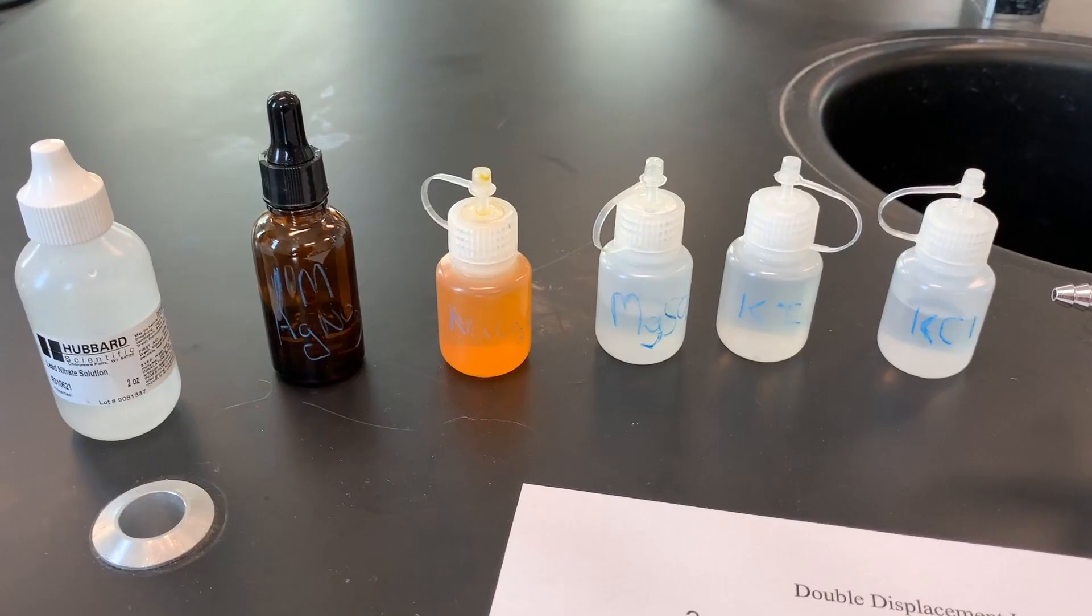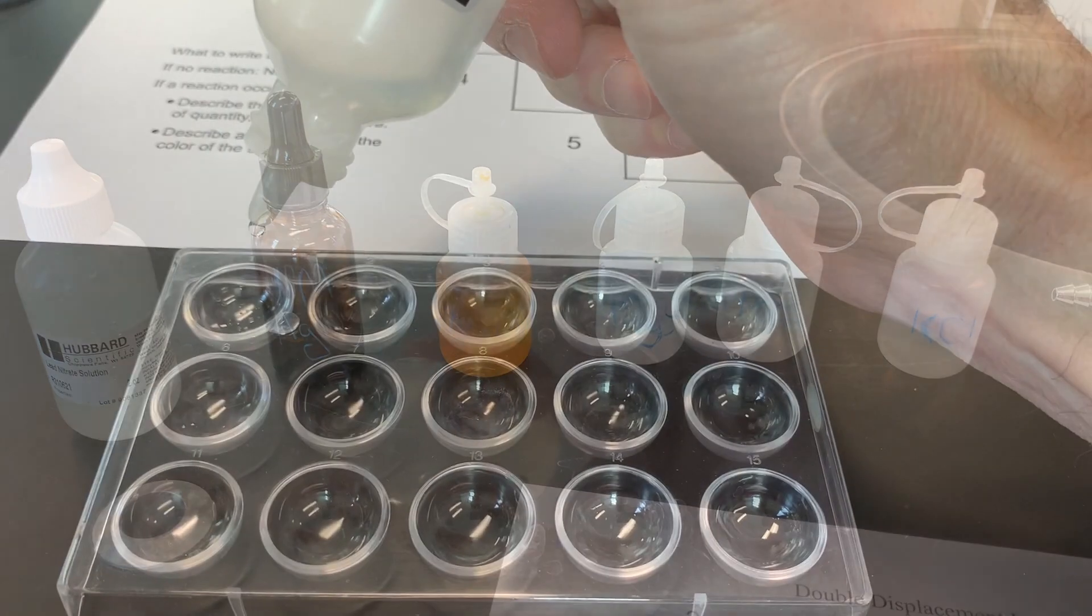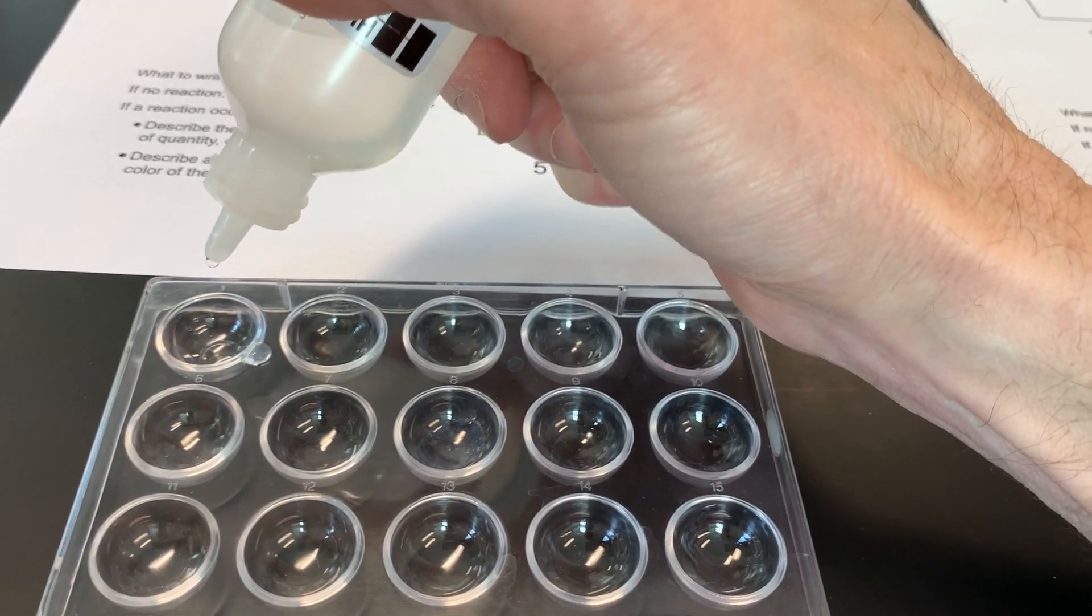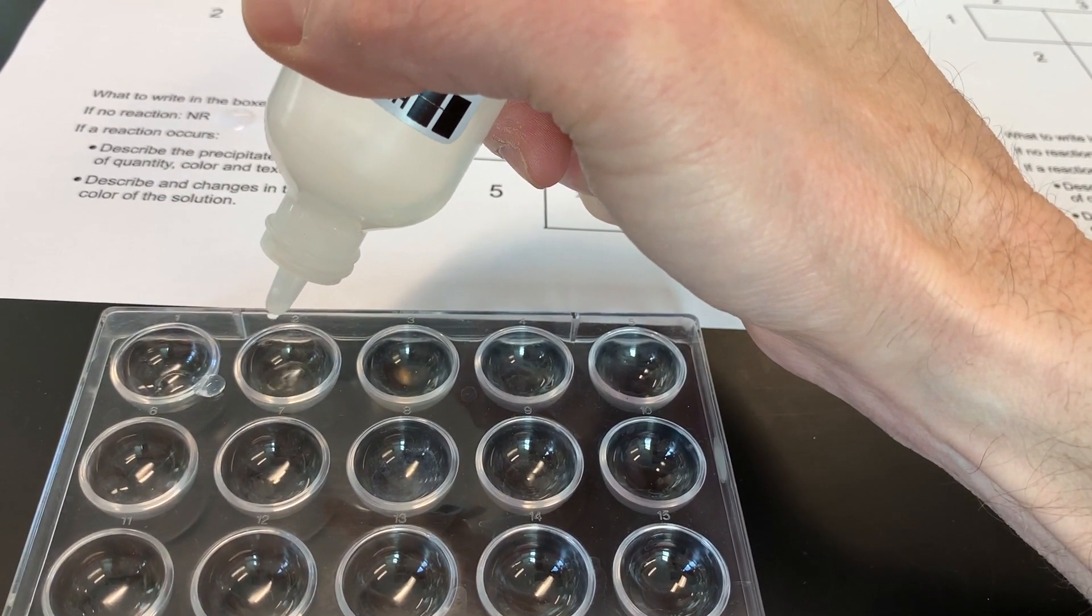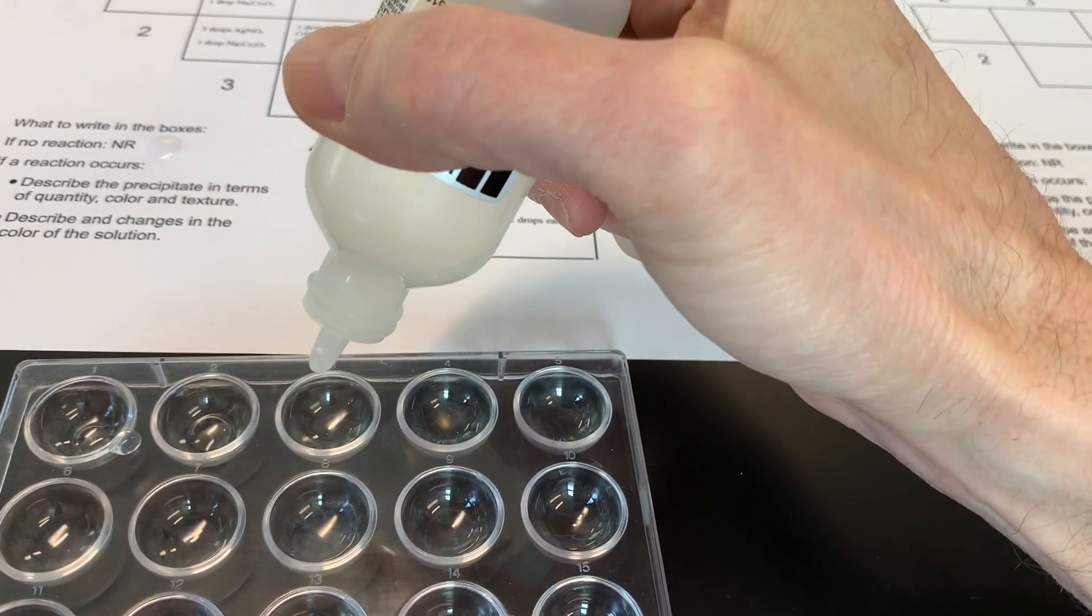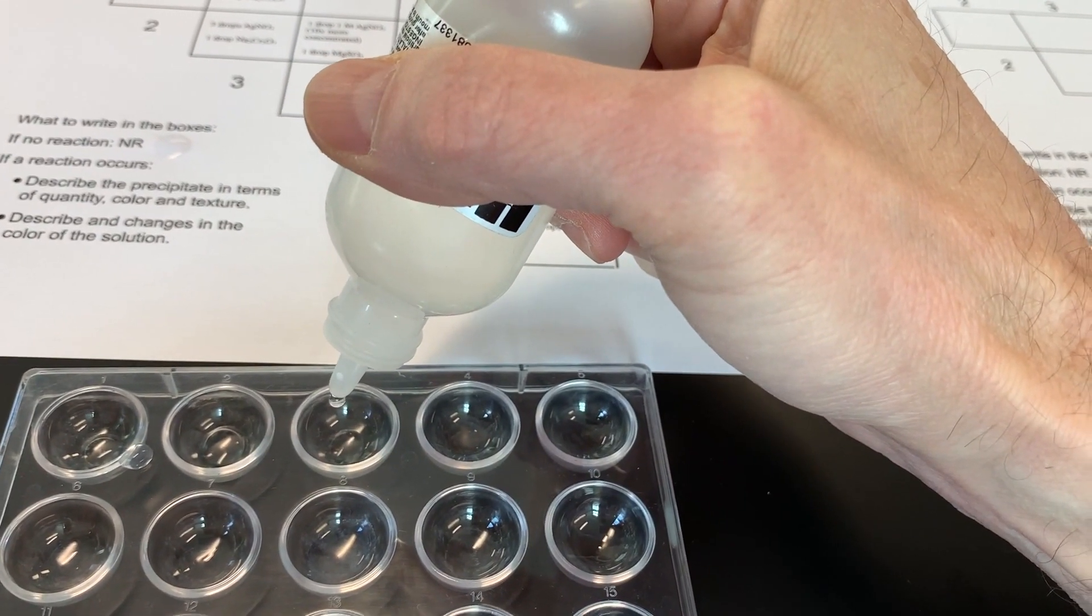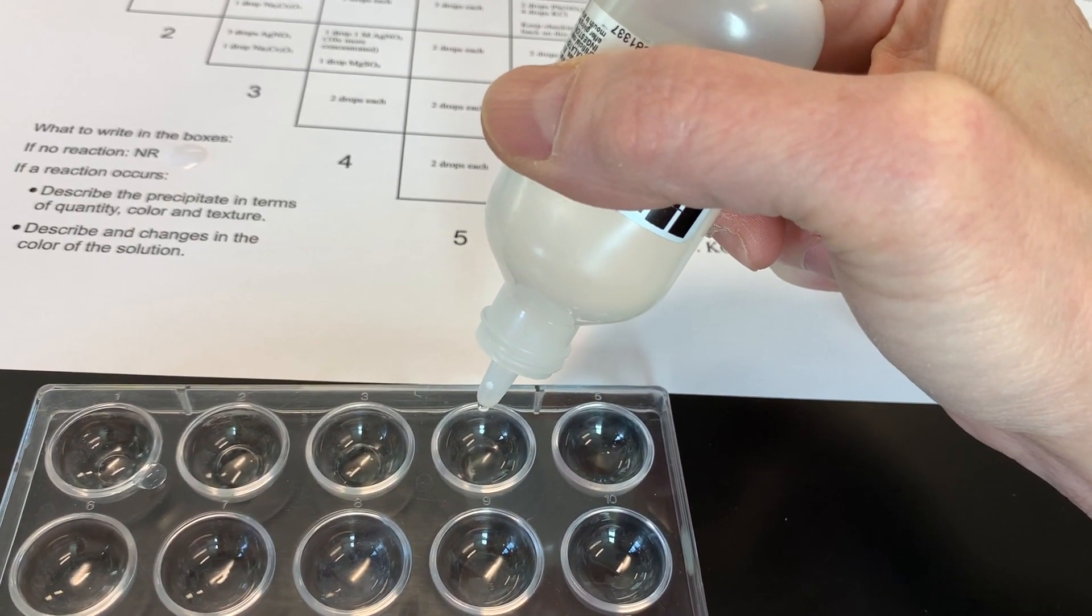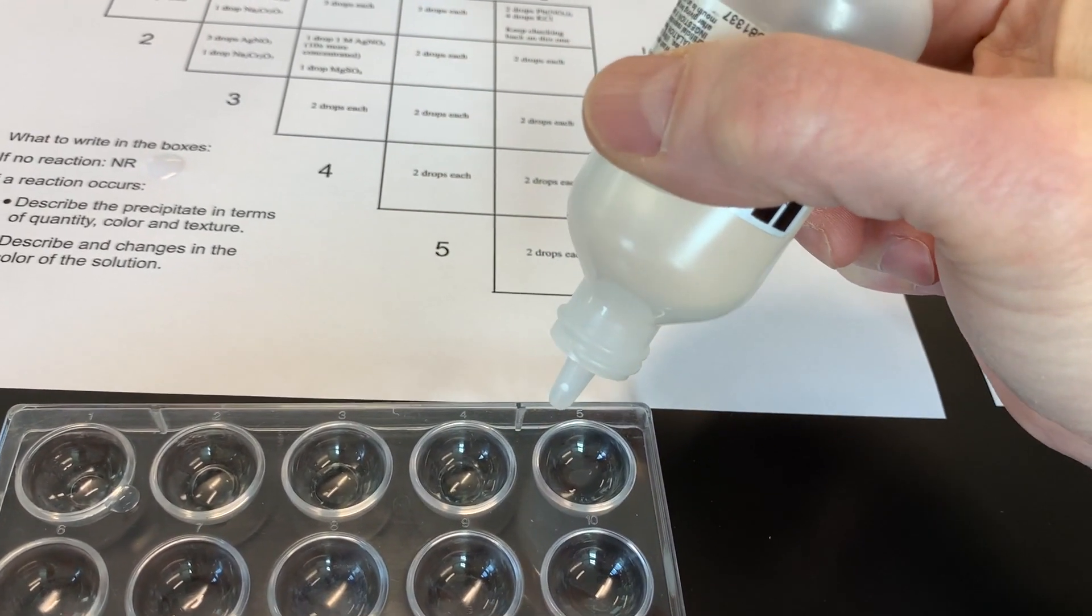The silver nitrate is in a brown bottle because it's light sensitive. Starting with the lead nitrate, we'll have two drops here, four here, three on this one—whoops, that's okay—three here, two drops over here, and two drops over here.